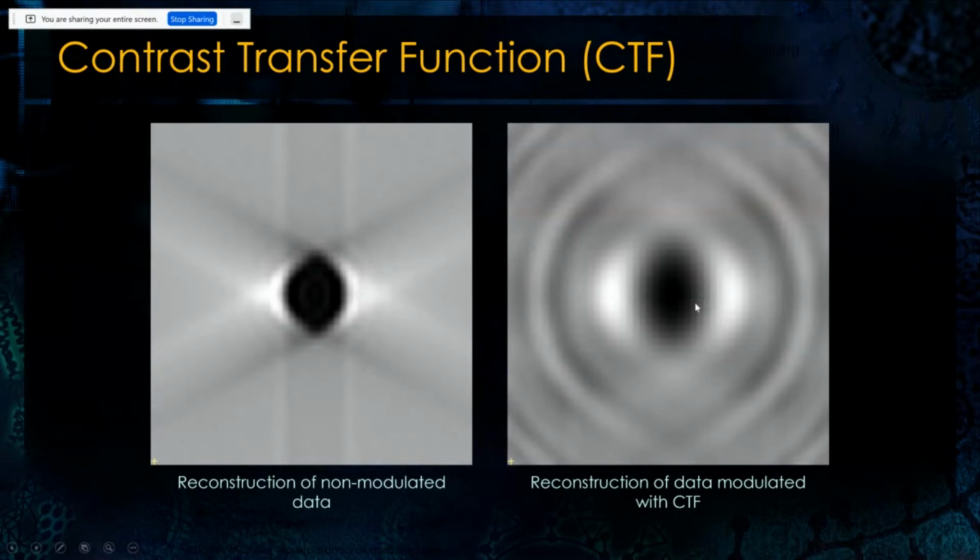It basically reminds one of a stone being thrown into water, and it gets these circles around it. It's not so apparent when you look at your data, because typically what we also have in tomographic data is a lot of noise. So it's never so visible like that, but nevertheless, that's exactly what's going on. So if you collect your data, the signal is always distorted in a similar way.